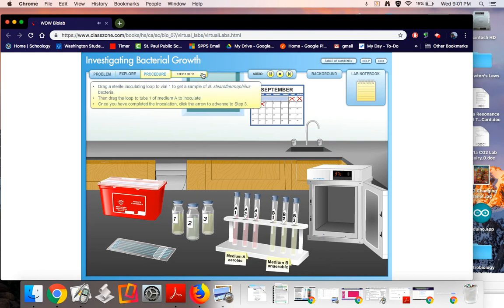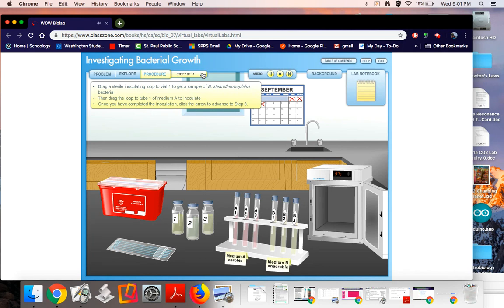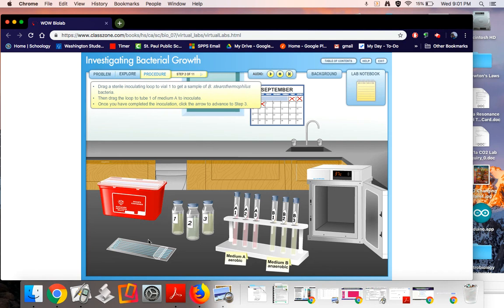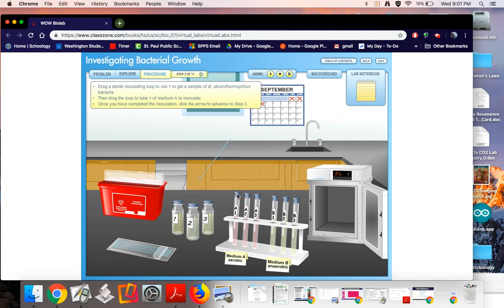Drag a sterile inoculating loop to vial one to get a sample of B. stearothermophilus bacteria, then drag the loop to tube one of medium A to inoculate. Once you have completed the inoculation, click the arrow to advance to step three. Okay, so at this point I'm going to mute the directions and I'm just going to do what I need to do. So go into here, get some bacteria, stick it in the tube, throw it away. Drag a sterile inoculating loop and then I'm going to do it again.